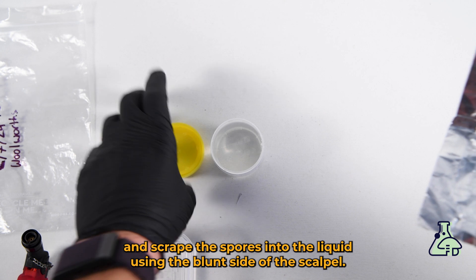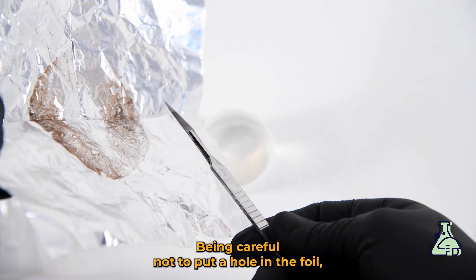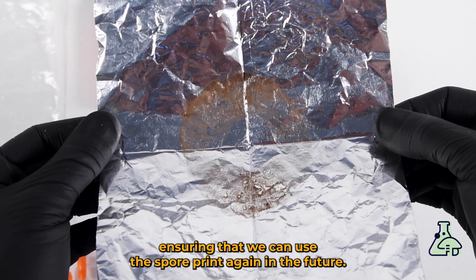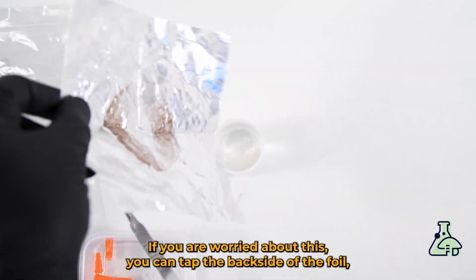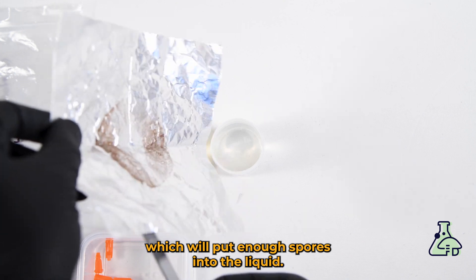Open up the container and scrape the spores into the liquid using the blunt side of the scalpel, being careful not to put a hole in the foil so we can use the spore print again in the future. If you are worried about this, you can tap the back side of the foil, which will put enough spores into the liquid.